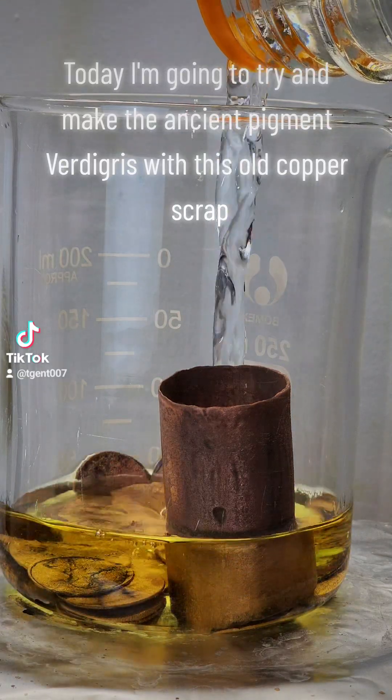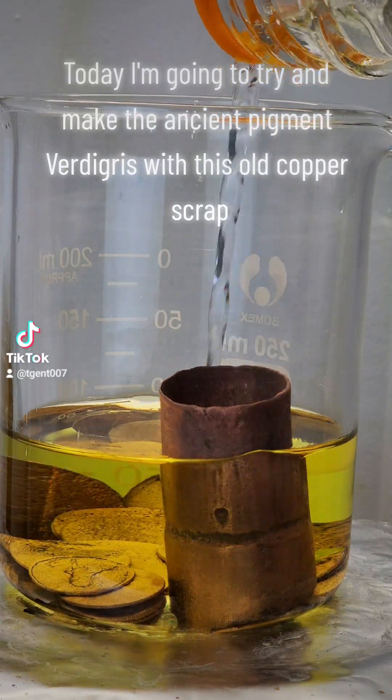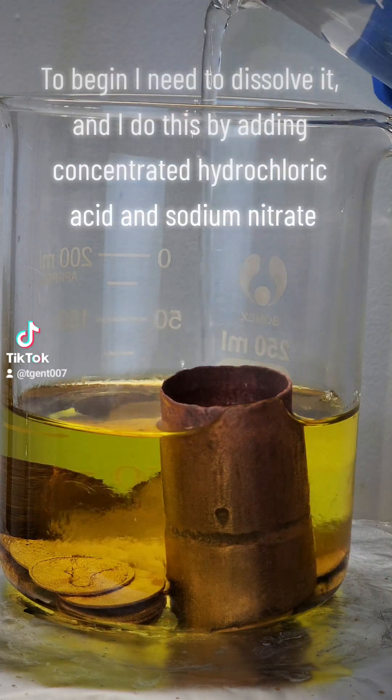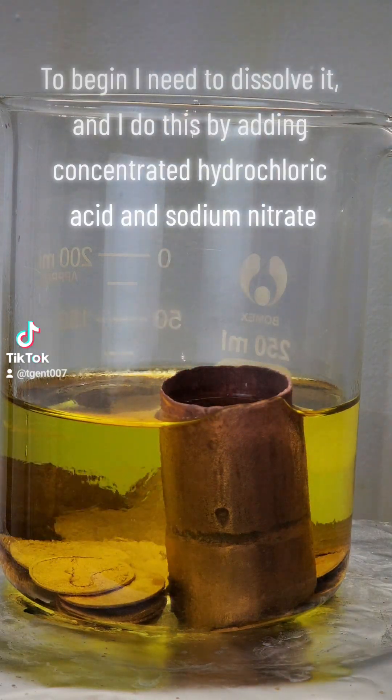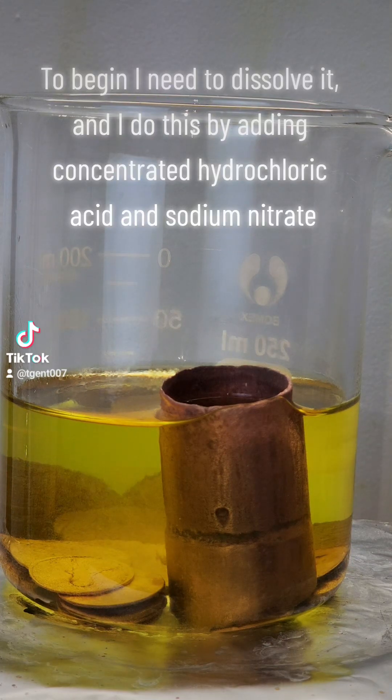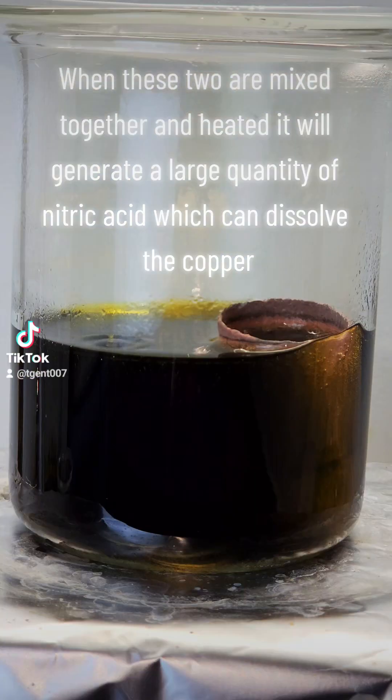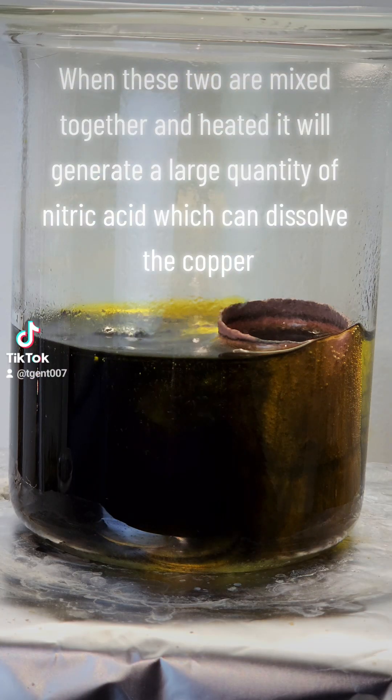Today I'm going to try and make the ancient pigment verdigris with this old copper scrap. To begin I need to dissolve it, and I do this by adding concentrated hydrochloric acid and sodium nitrate. When these two are mixed together and heated, it will generate a large quantity of nitric acid which can dissolve the copper.